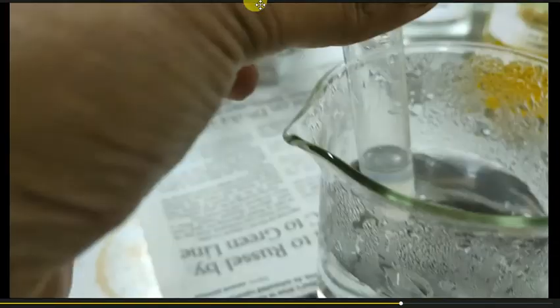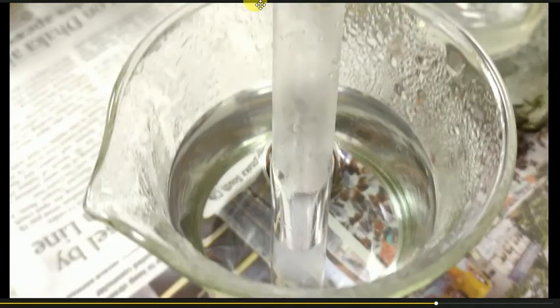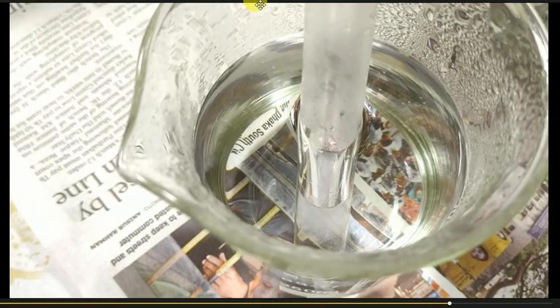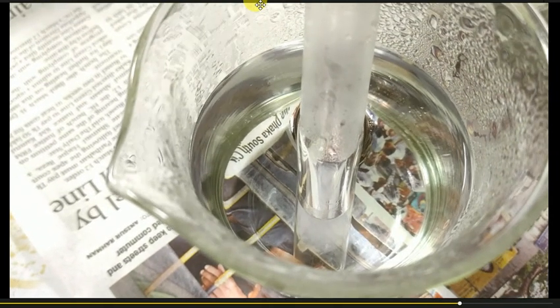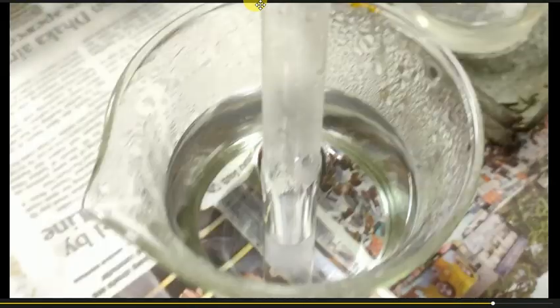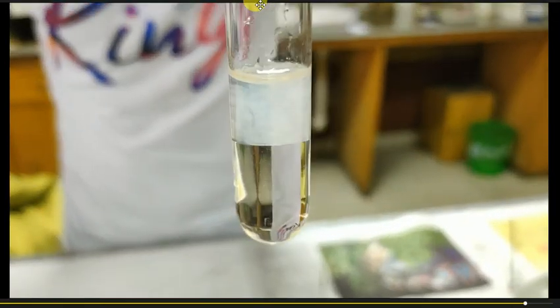Now we are heating this solution in the water bath. We can see that the precipitate is appearing at a faster rate. The precipitate reappears. This is indicative of the presence of aluminum ion.